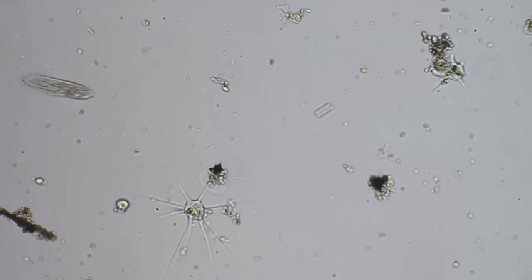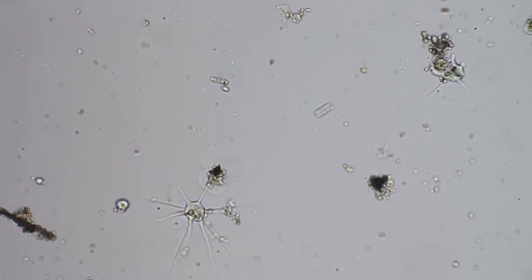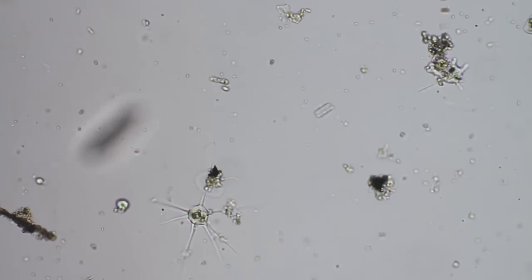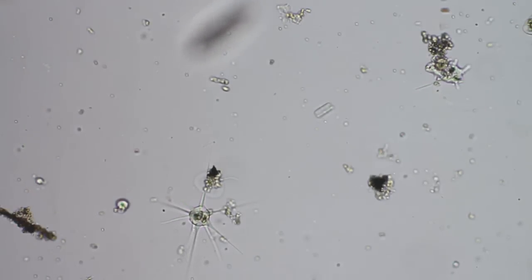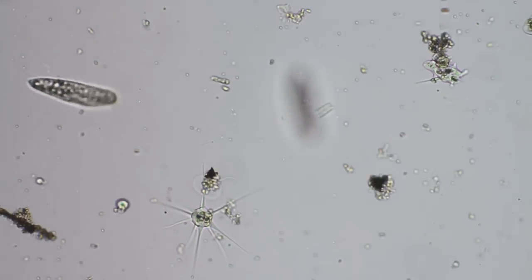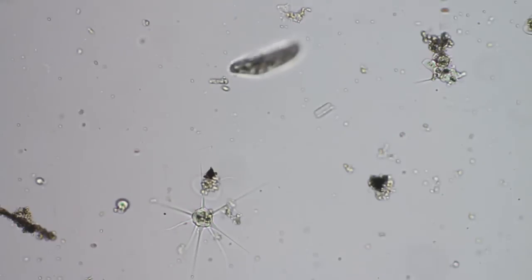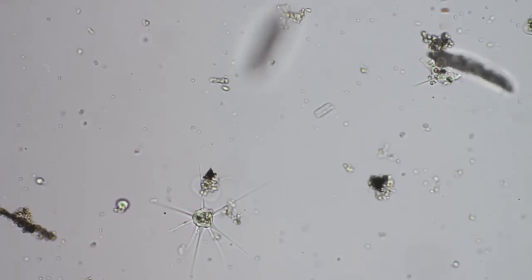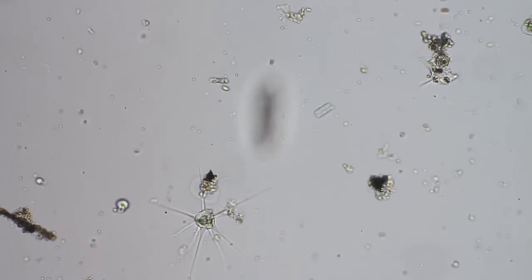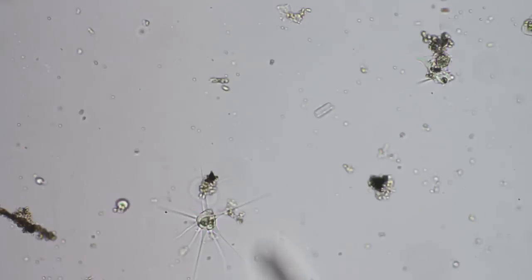I'm using a Nikon Fluofod with a CF-10x objective lens. I have a 10x photo lens in the trinocular port and I'm using a Canon T1i 1.6x crop sensor camera. So this is roughly about 320 power.